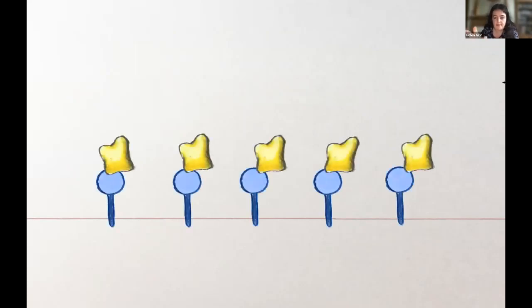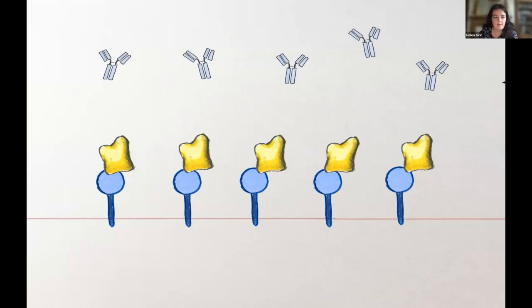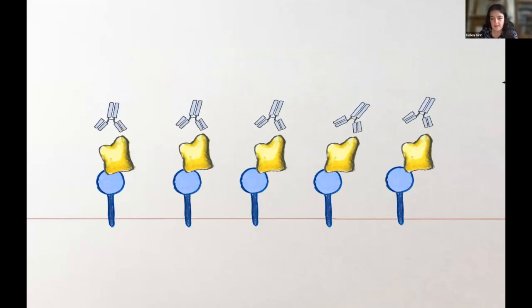And so what Daming did in Oxford was to fix the receptor binding domain onto a biolayer interferometry layer, which is able to respond to the mass which has been bound to it. So if we introduce an antibody which is able to bind to the receptor binding domain, it will produce a 100% proportional signal boost for a single antibody mass, one can think of it.